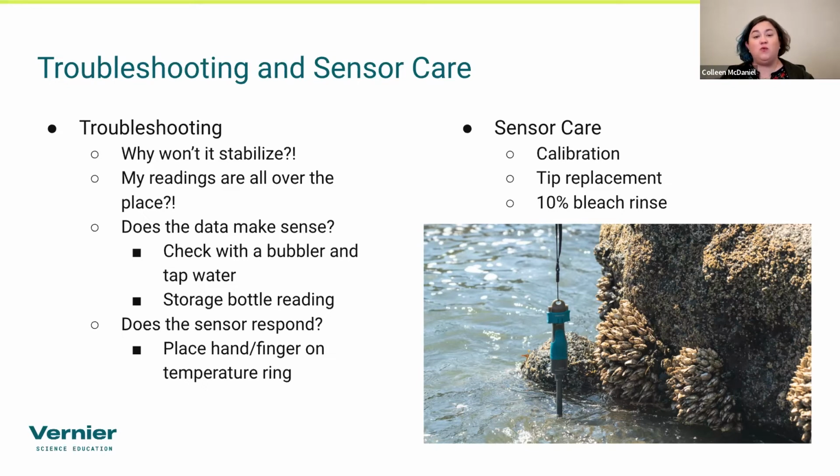One other common question is, why are my readings all over the place? If Susie's getting a reading with her sample that's 8.5, Johnny's getting a reading that's 8.8, and somebody else is getting a reading that's like 8.2, those are all within the general same range, so it's okay. Now, if you start to see readings where somebody is getting a reading of like 9.2 and somebody like 7.5 milligrams per liter, that's a bit of a bigger difference.